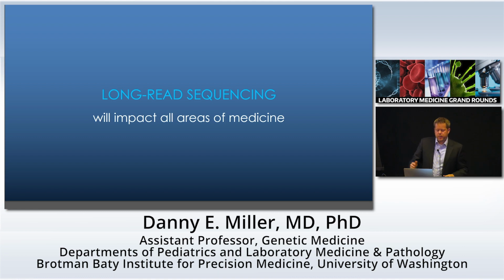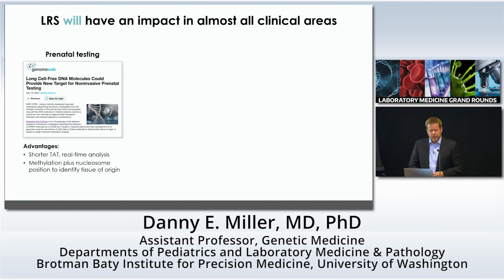So I want to wrap up by thinking about how long-read sequencing will impact all these different areas of medicine. I'm optimistic about this. I'm excited because I think there are a lot of projects and a lot of different assays that could benefit from long-read sequencing as well. And the first is simply prenatal testing.